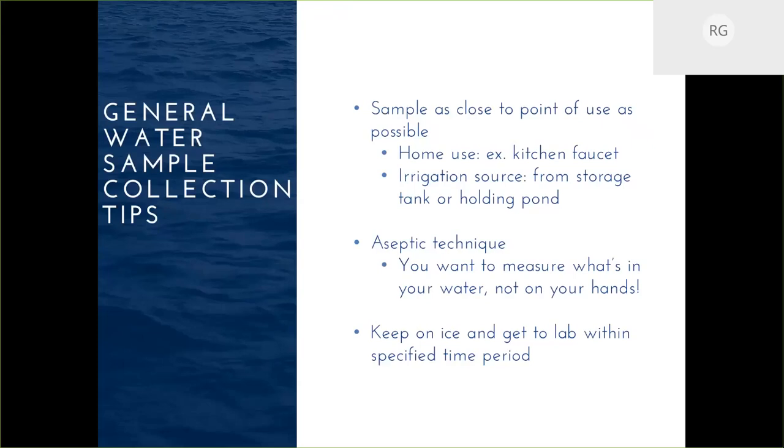Aseptic technique is also really important when we talk about water sample collection. Basically, aseptic technique means not contaminating your actual sample. You want to measure what's in your water, not on your hands. So to do that, I'm sure we're all washing our hands a lot right now. You need to start with washing your hands.